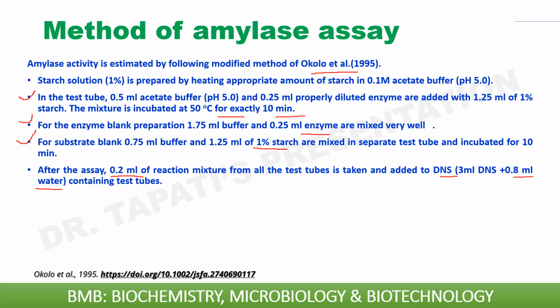Therefore, in this case also we are making a total reaction mixture of 4 ml, where 3 ml is DNS and 1 ml is sugar. So we have to measure the sugar content of 1 ml of reaction mixture.